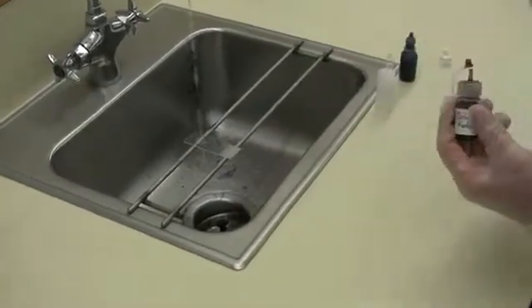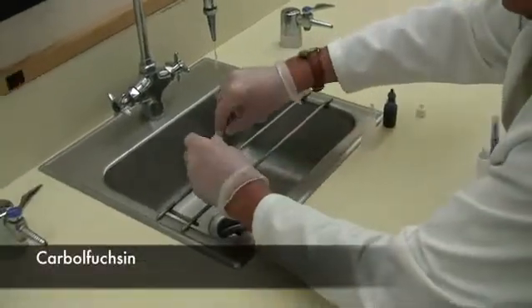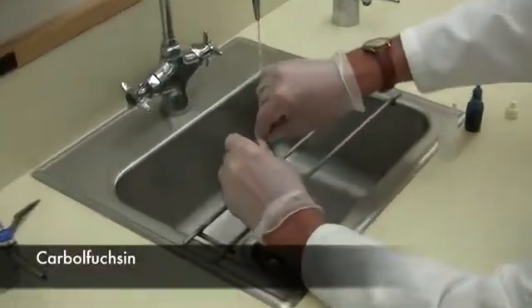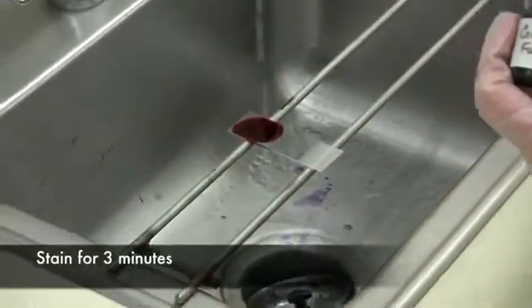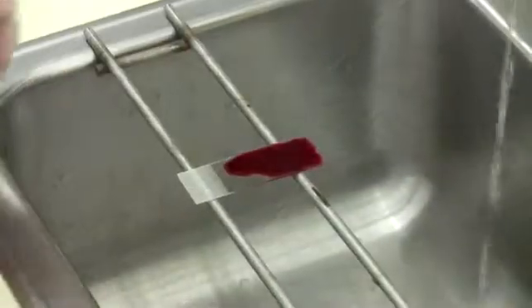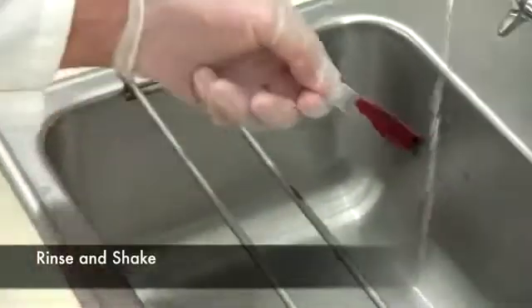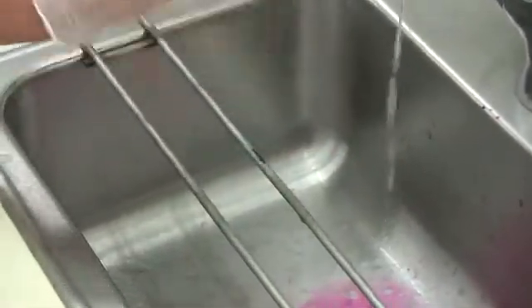The staining procedure is very simple. We start off with carbolfuchsin — just cover the smear with however many drops it takes to cover that smear. Leave it on there for three minutes. After three minutes, you want to rinse the carbolfuchsin off the slide and shake off the excess.